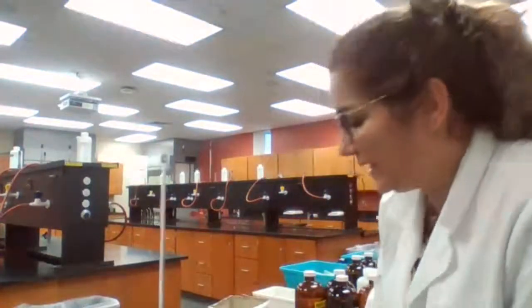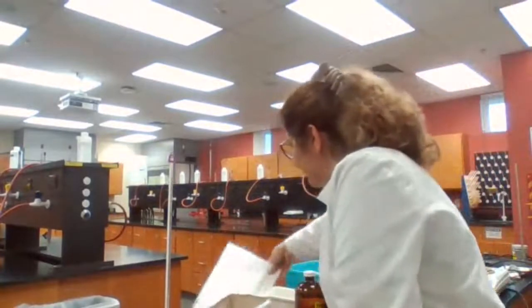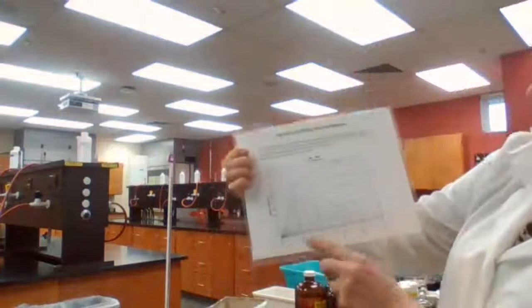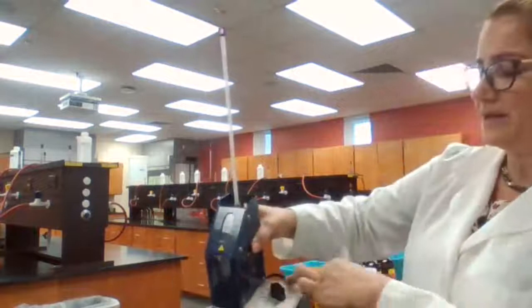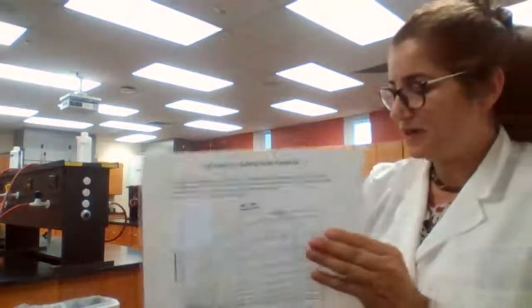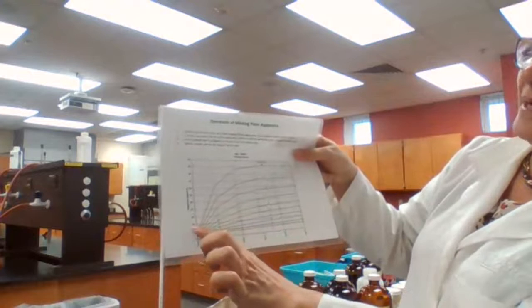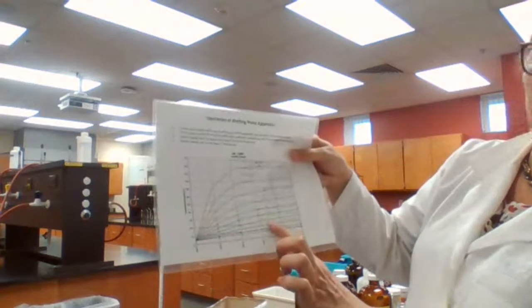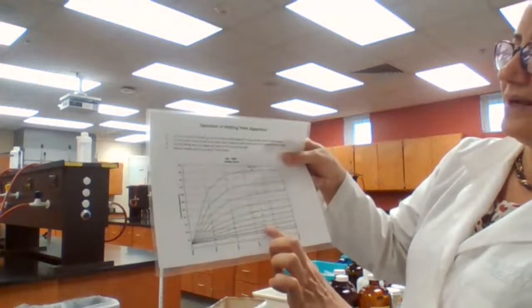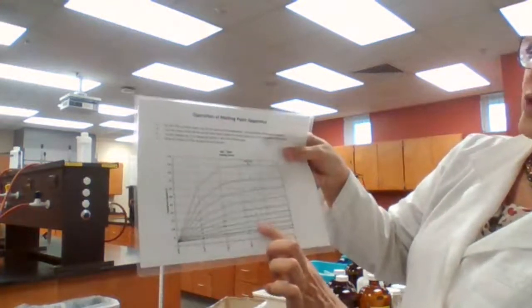Okay, I'm going to heat up. The melting point for this compound is 80 degrees. So based on this chart that I have here, I can determine what should be the setting for the power regulator. If the compound is melting between 100 and 150, the setting should be between 4 and 5. If it's melting around 100, the setting should be between 3 and 4. So for 80 degrees or anything between 50 and 100, it is going to be at 3, no more than 4.